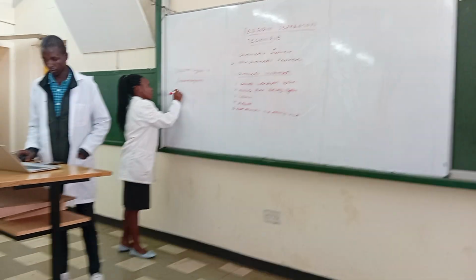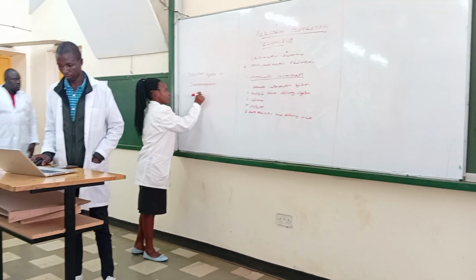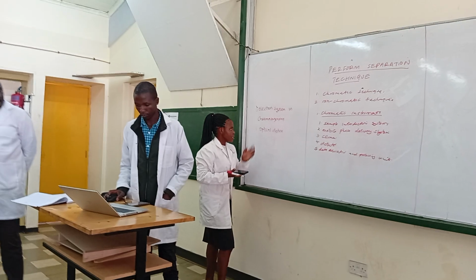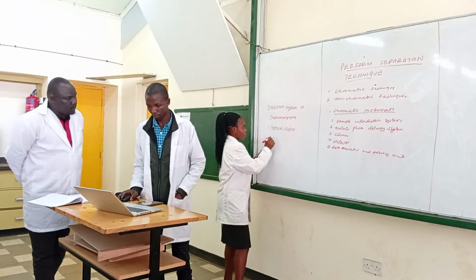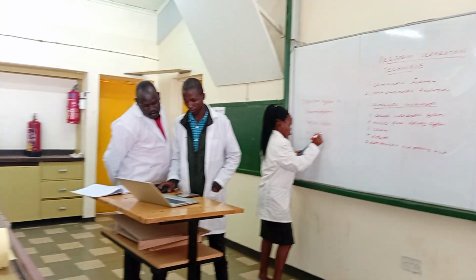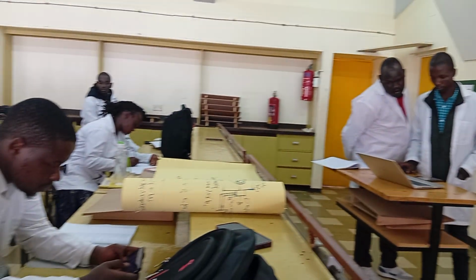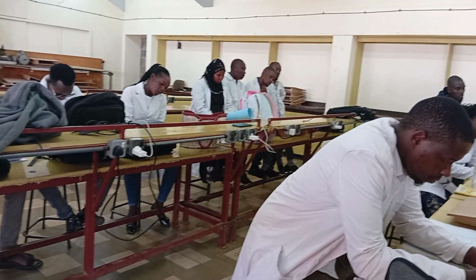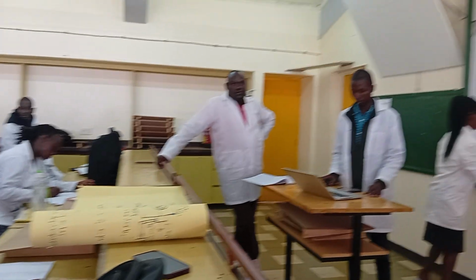One, we have optical detectors, and this entails the UV detector and fluorescent detector.